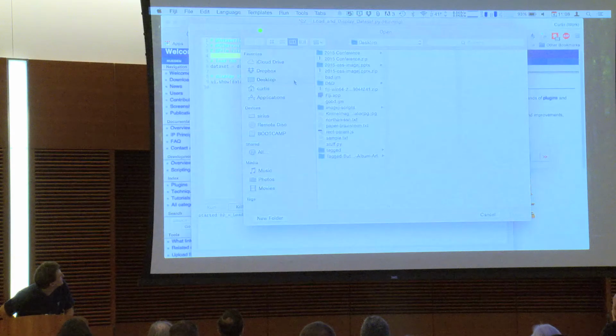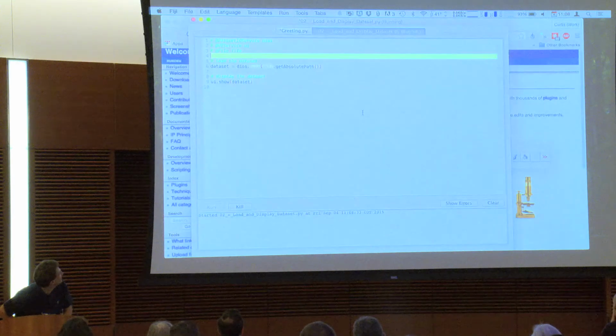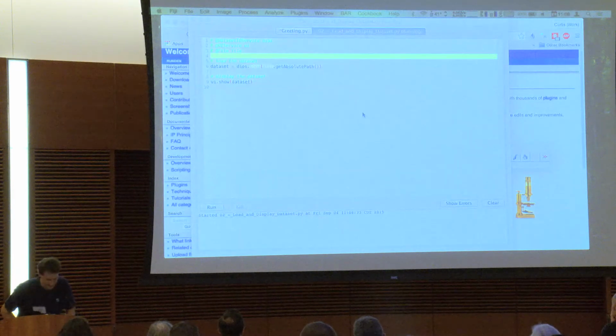Do I have any images on my desktop? Yes. I don't. Okay, cool. Thank you. It did open. It's just over here.